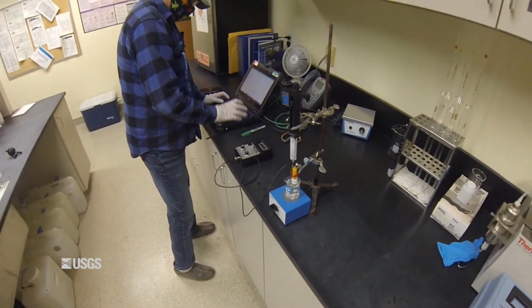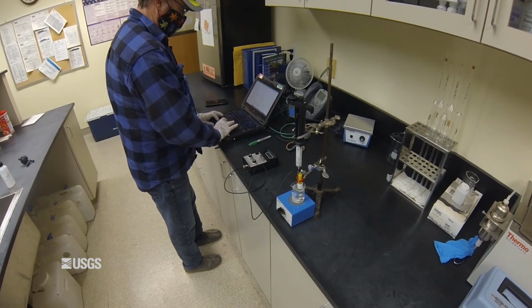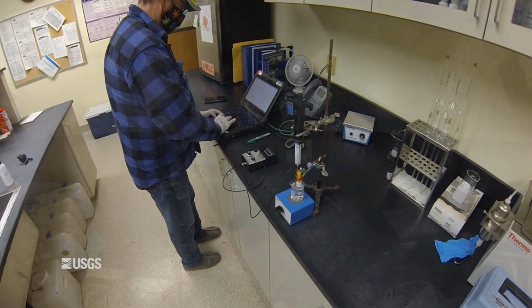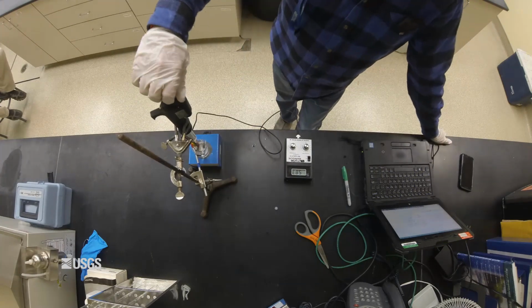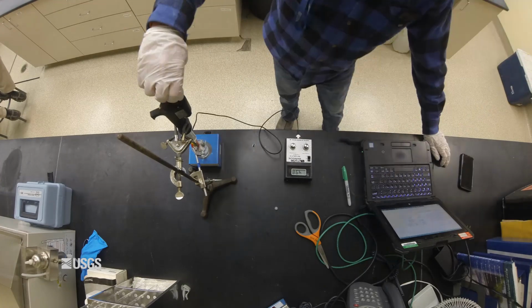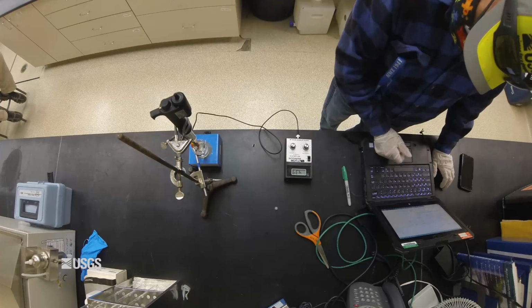Hi, Ron Cobble again. Back in the office, we process an alkalinity on a filtered sample we collected earlier today. Alkalinity measures the ability of a water sample to neutralize strong acid. As seen in the time-lapse video, I am adding a known quantity of sulfuric acid to a known quantity of sample in order to determine the maximum rate of change in pH per volume of titrant added, also known as the inflection point method.